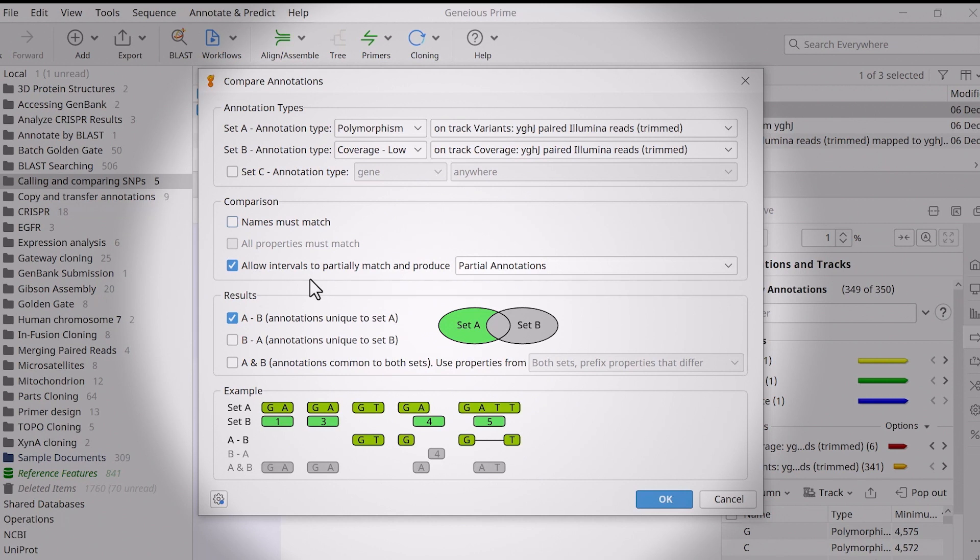In the Results section, select A-B. As the example diagram at the bottom demonstrates, this will return polymorphism annotations that do not overlap with coverage annotations.